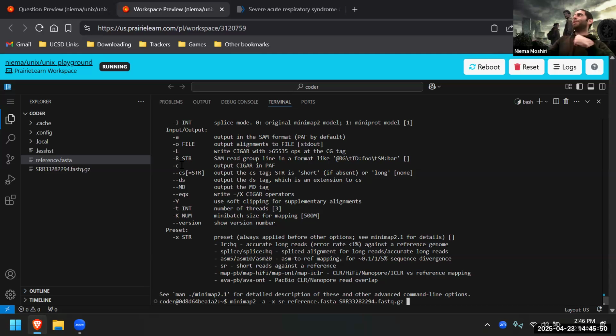Oh, is that why we have to index? So it's not why we have to index, it's we have to sort them because we want to index them. Once they're sorted, we can run samtools index, which is going to create an index file that's going to specify, at this offset of the file, here is where this position of the reference genome starts, and so on, so that any downstream tools can very quickly jump to specific parts of the binary file. Not constant time, because technically it has to seek the file. So we sort it so that we can index it to make downstream things much faster.